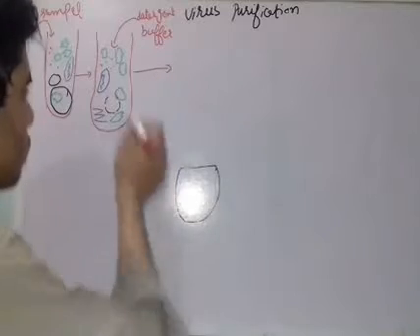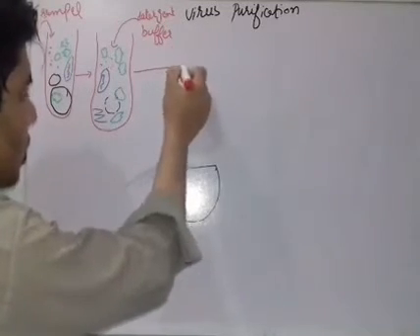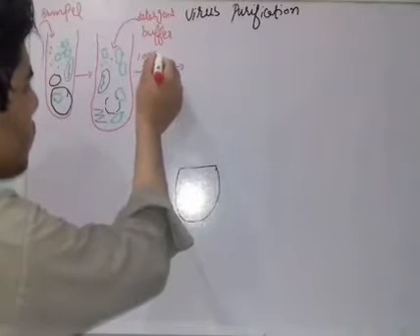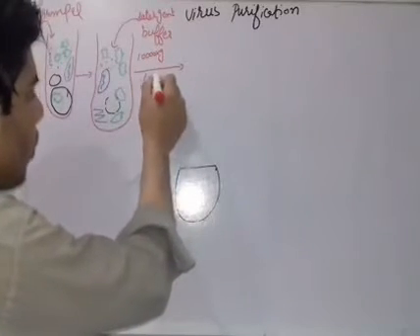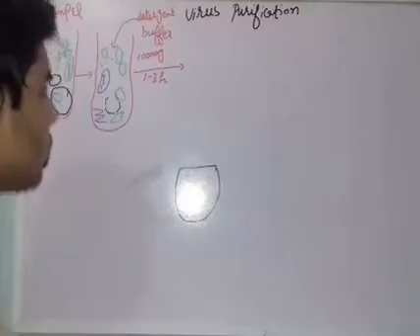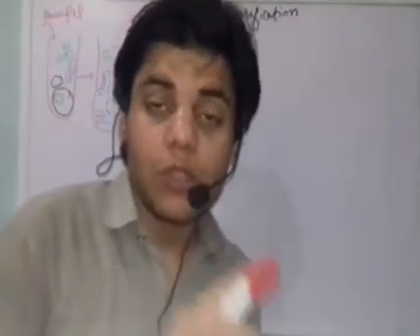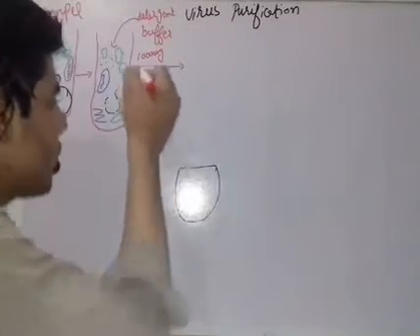So we proceed the tube for the centrifugation at 10,000 speed. On that speed we centrifugate it for 1 to 3 hours. Fine. So for 1 to 3 hours at 10,000 speed, we centrifugate the tubes. Let's suppose C represents the centrifugation.